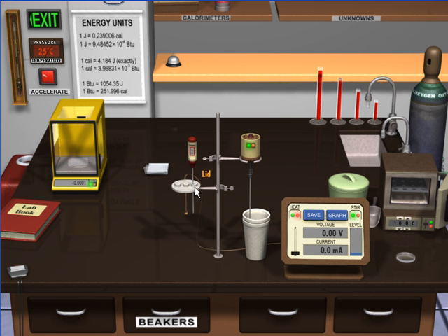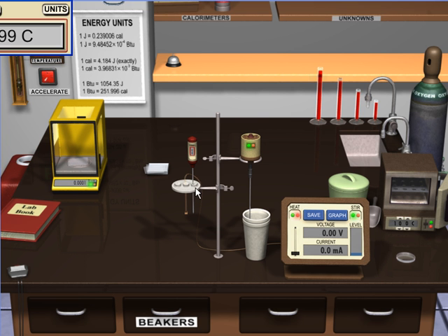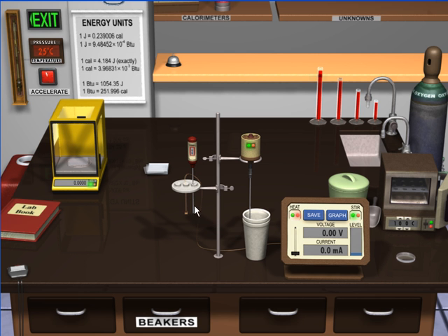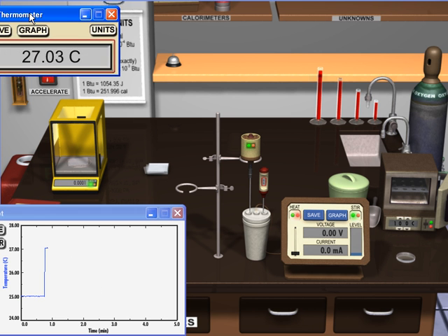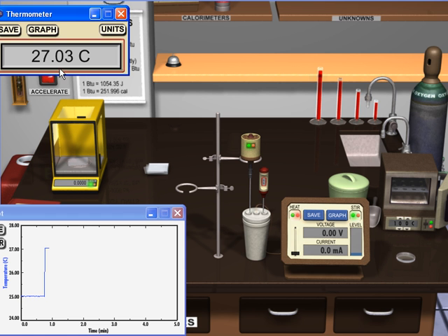And I need to be able to grab onto this lid. Sometimes it gives me some trouble. And it's not being very helpful to me right now. There we go. We've got the lid. We've got a nice plot there. We've got our temperature. 27 point, looks like 0.03. You want to record the highest temperature, because of course over time this will start to drop off.